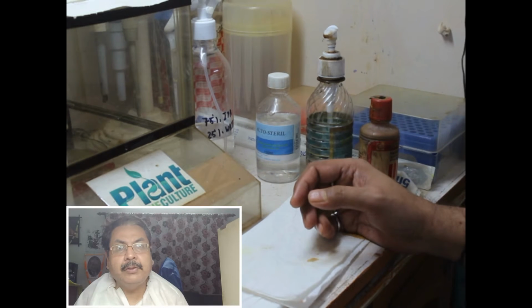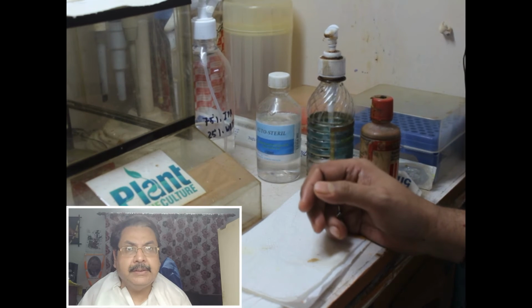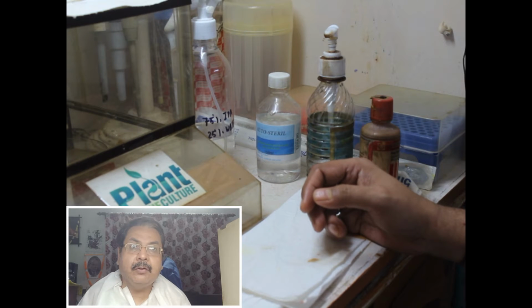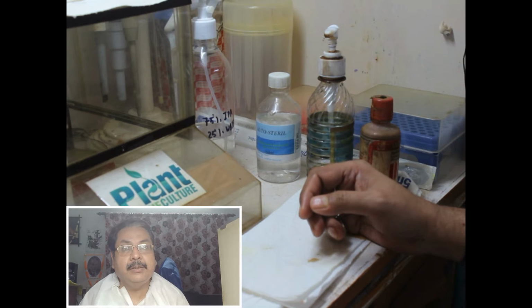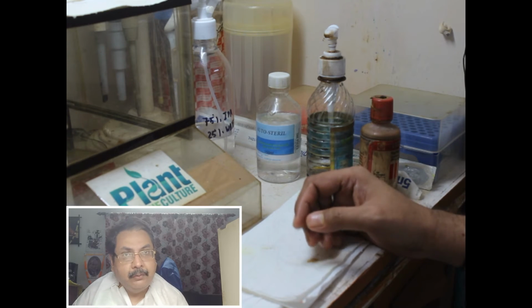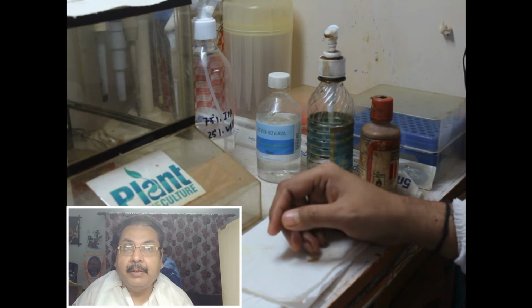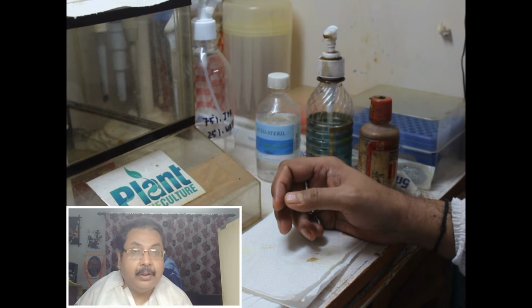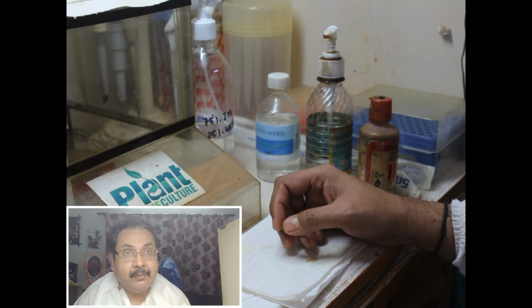You should always purchase these instruments from a reliable source. Because if your instrument is not calibrated well, or not maintained or made well, then you will become a part of their R&D. I know that many good companies are making them, but you should purchase from a very reputed company.